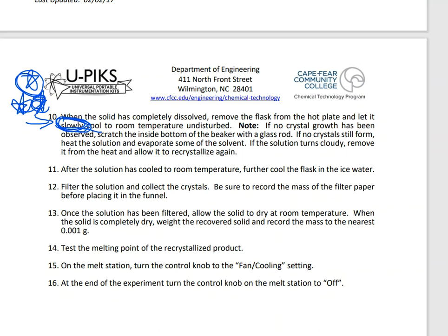So what you've just done in previous steps was no good. It was wasted. Wasted time because you were so impatient that you did not allow your sample to slowly cool to room temperature before you put it in the ice bath.